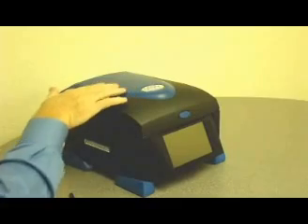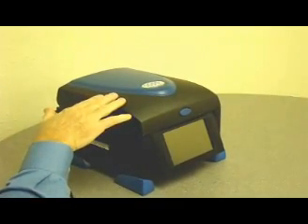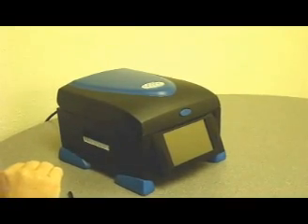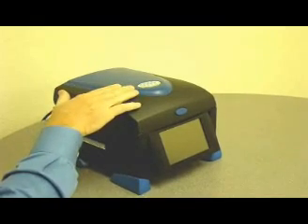The single button in front is designed to operate the lid. You'll notice there's no knobs or levers on the top of the lids like traditional cyclers, because our lid functions automatically. It will apply the appropriate pressure for tubes or plate without any adjustments by you.